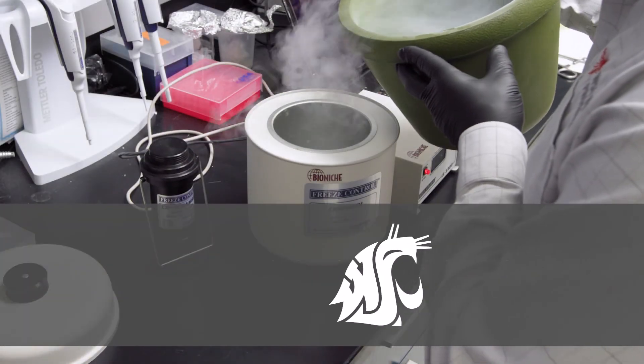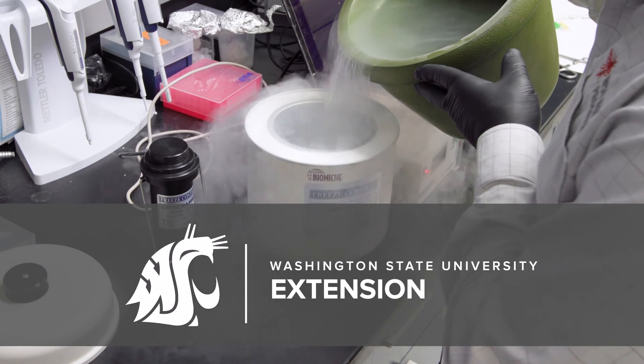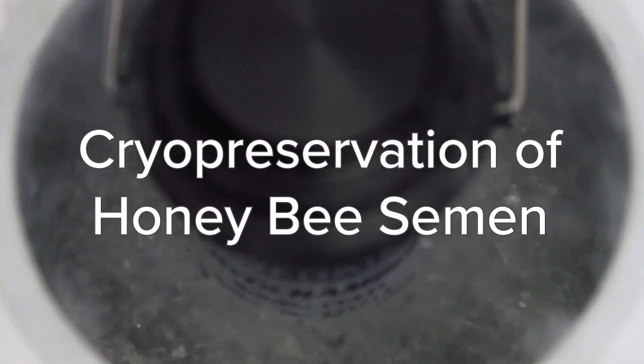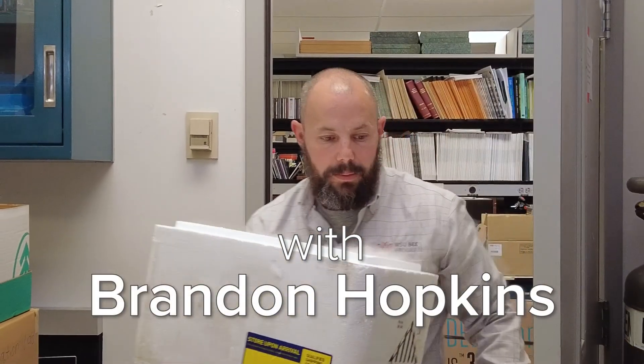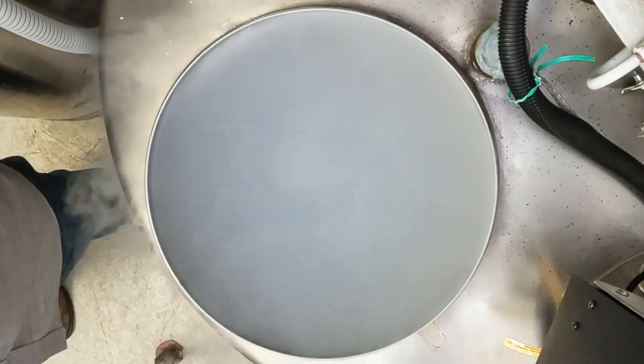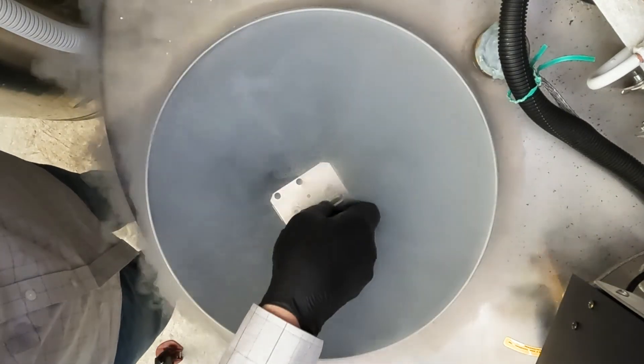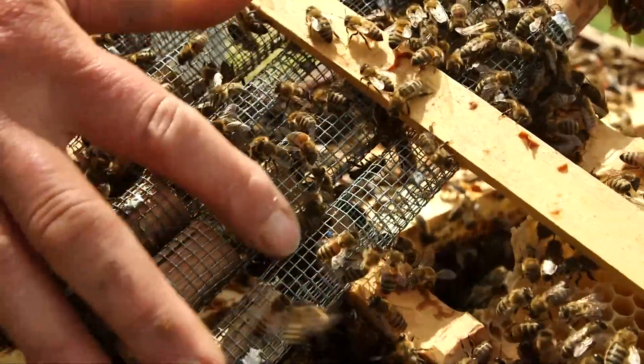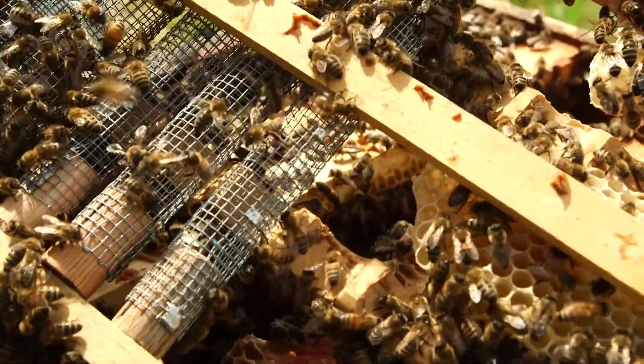Thank you for joining us. One of the most critical precursors to the pursuit of cryopreservation of semen is to have a successful artificial insemination technique, and the honeybee system is fortunate to have a long-standing and highly successful insemination technique.